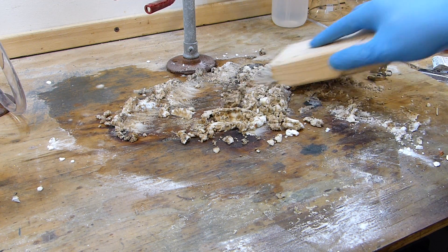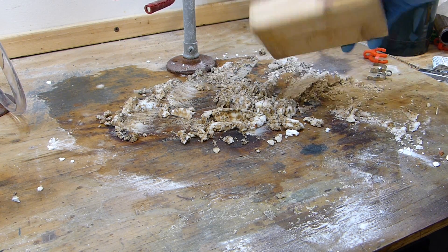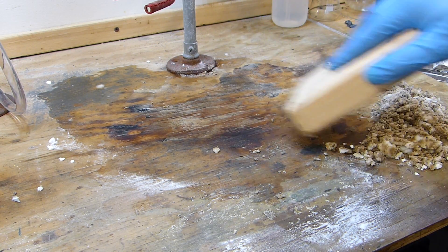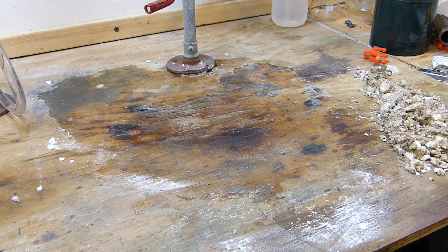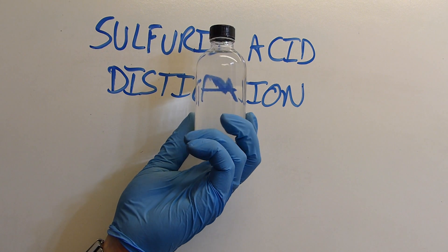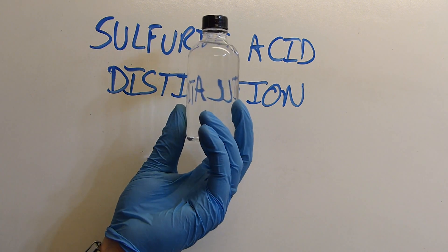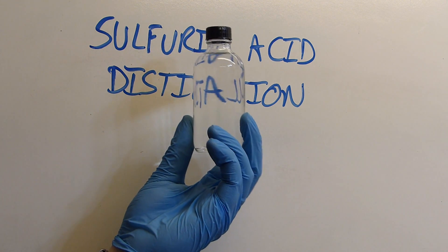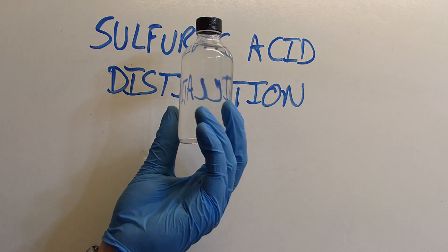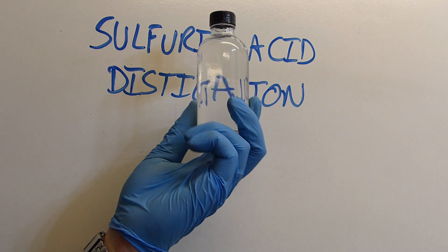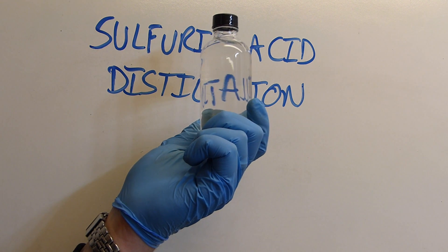Right here I'm just working the bicarbonate into the table which just prevents further carbonization, but you can see that when the bicarbonate is eventually scraped off and swept up that the table really hasn't stained much more than just a slightly dark stain. And here's the final product, a crystal clear syrupy liquid consisting of 98% sulfuric acid. We also learned how to clean up an acid spill and to add boiling chips to a reaction flask that we already started heating along the way, and those are valuable skills to have in any laboratory whether organic or inorganic.